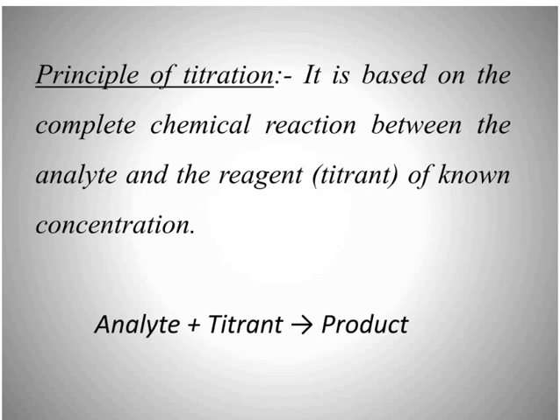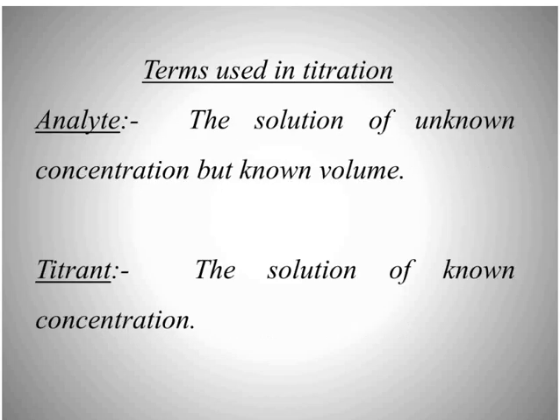You know my friend, the principle of titration is based on the complete chemical reaction between the analyte and the reagent titrant of known concentration. So analyte plus titrant gives product.